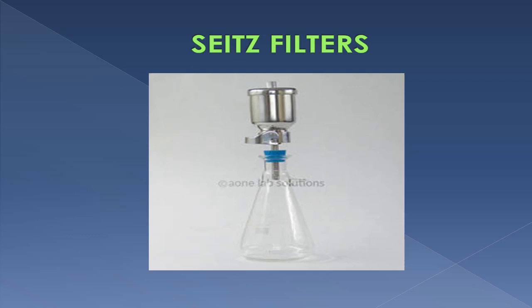They are pad-like and thicker than membrane filters. This germ-proof filter is used to replace the Berkefeld biological filter. It has a place in modern pharmacy, and all progressive pharmacists should know what it is and how to use it. The bottom is a circular piece of metal terminating in a metal tube the shape of a chemical funnel and has a removable wire mesh to support the filter disc. The disc is made up of fibrous material packed hard.